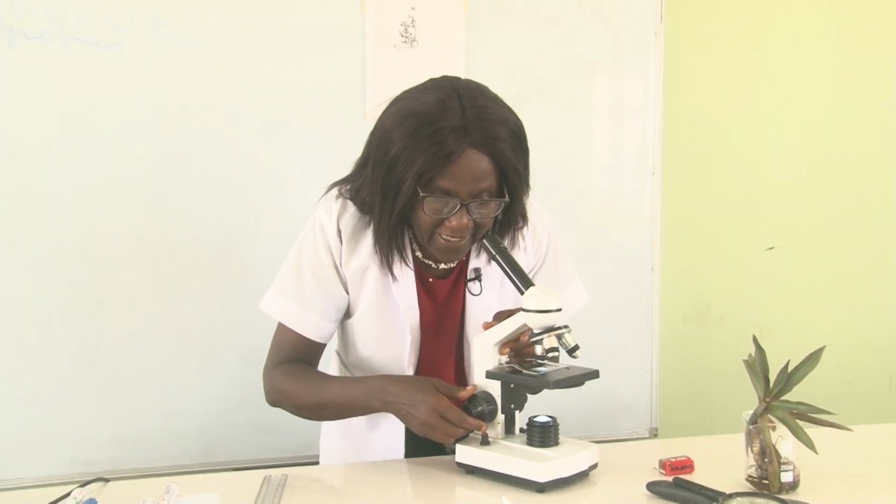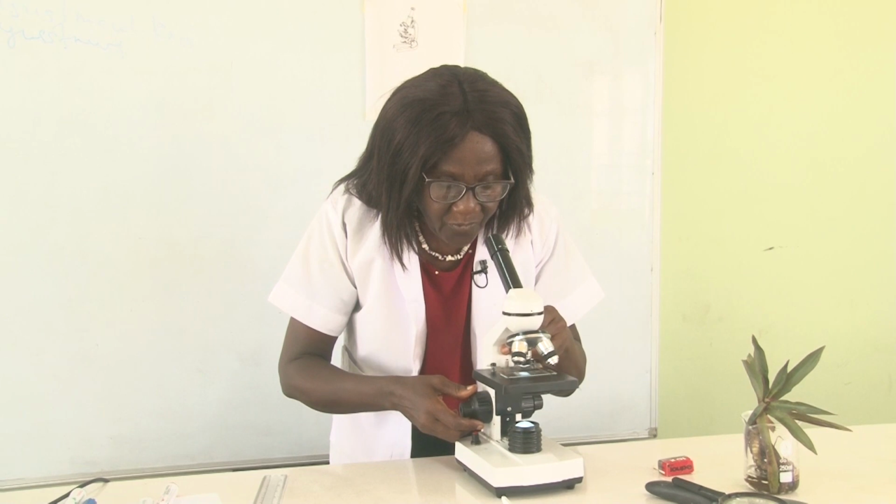Right. In our next lesson, we will continue from here to look at how you can use the high power objective lens to look at your specimens very well. We will also look at the magnifying power, magnification of the microscope. We will look at how to care for microscopes, and we will look at resolution of microscopes.